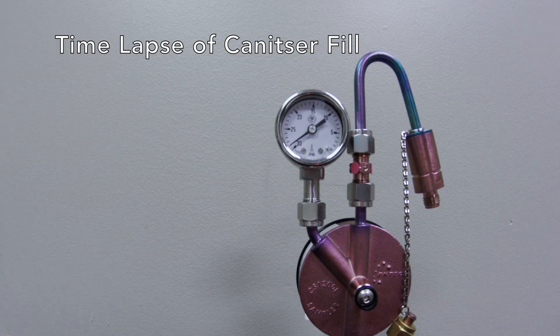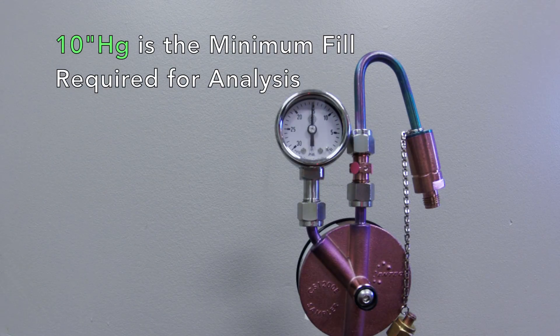As the can samples, the needle will move clockwise towards zero. For your specified sampling period, the flow controller is calibrated to sample past 10 but not all the way to zero.